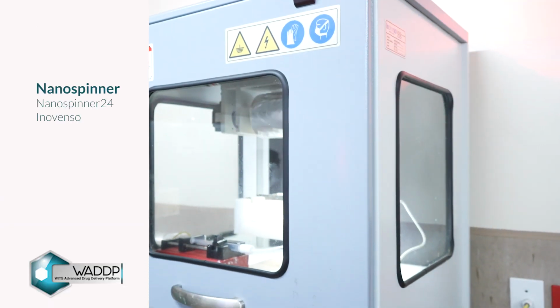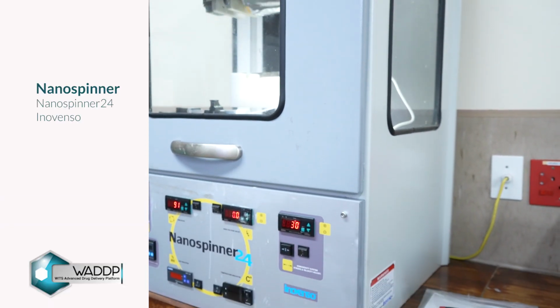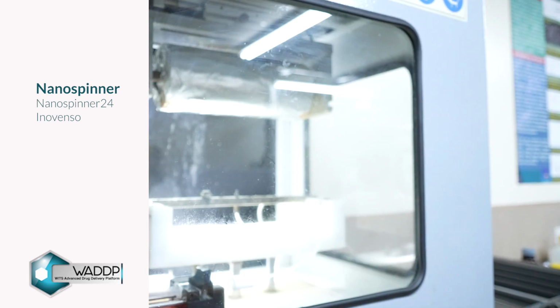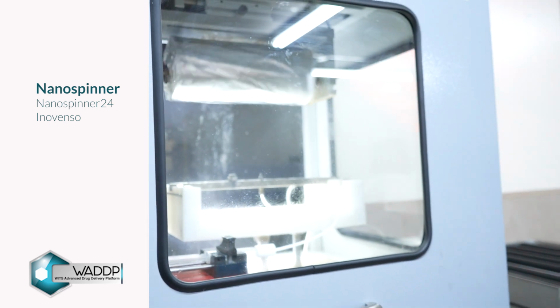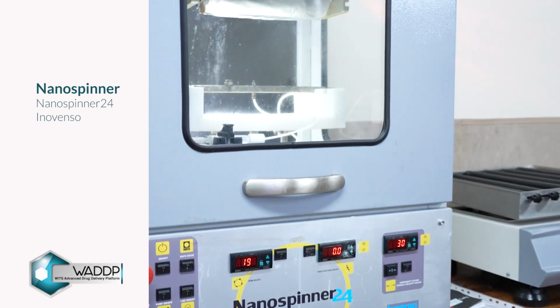A nanospinner is used to produce nanofibers, fibers with diameters typically in the range of tens to hundreds of nanometers, primarily through a process called electrospinning.